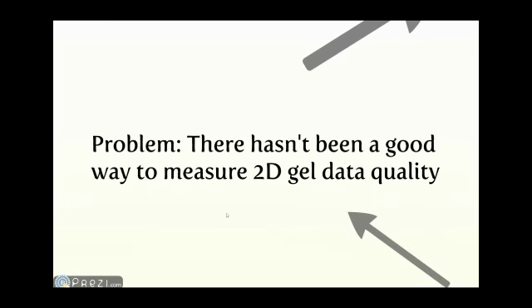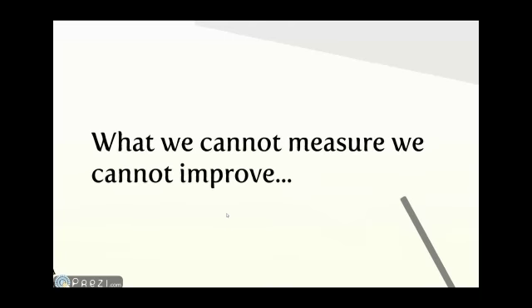But the problem is that there hasn't really been a good way of measuring 2D gel data quality. The technology has been around for, what is it, more than 2 decades or something. But so far, there hasn't been a reliable way of assuring that the data that you can extract from the images is correct and complete. You know the saying, what you cannot measure, you can't improve.